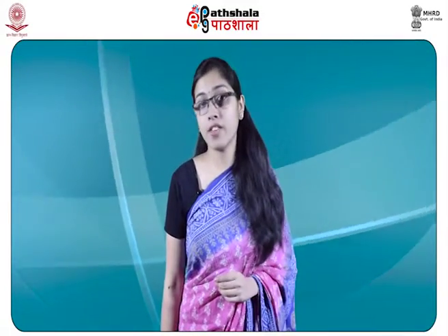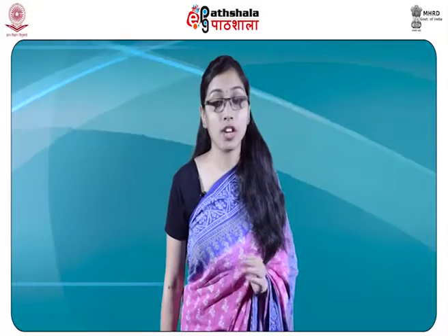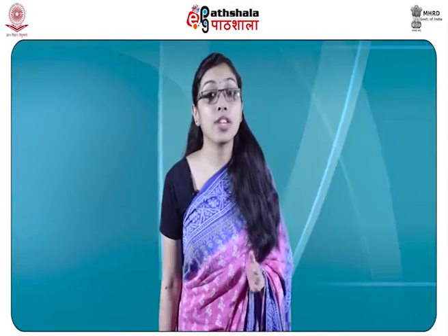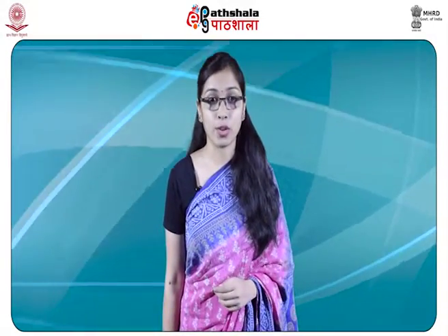For many, fire investigation proving that arson was committed is relatively easy as compared to proving that a particular person was involved in the case. Forensic examination of arson scenes should be pursued so that valuable physical evidence such as friction ridge impressions that could be used to identify the suspect is not overlooked.